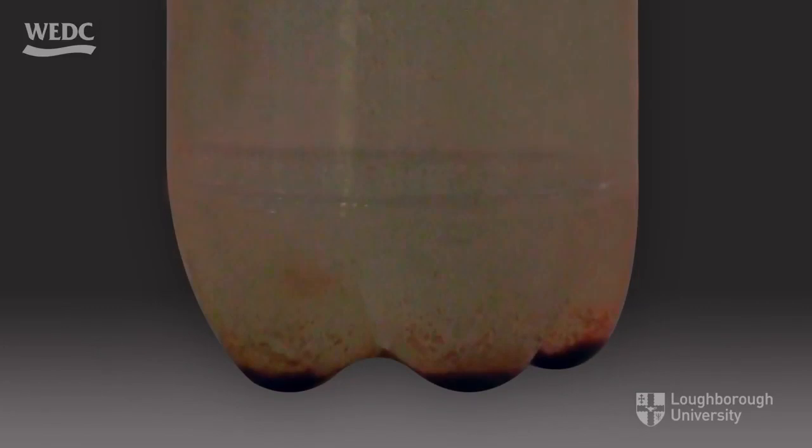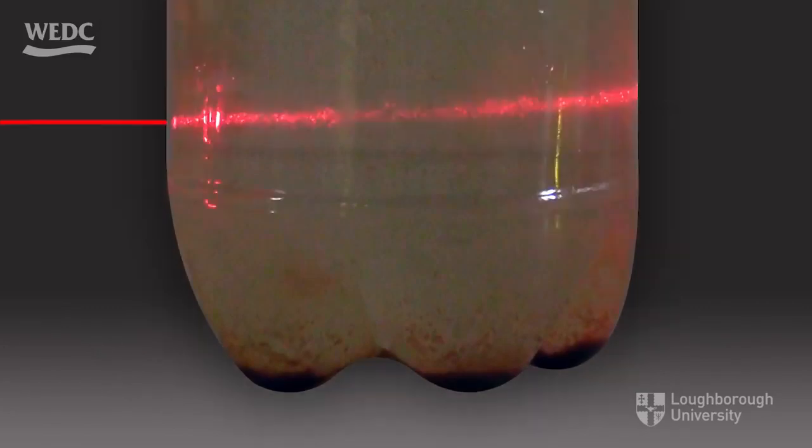Here we have iron in water. It looks coloured, and again, as we shine light through it, the light scatters. It's rather like car headlights on a misty evening. You can follow where your headlights are pointing because the tiny water droplets in the atmosphere scatter the light.